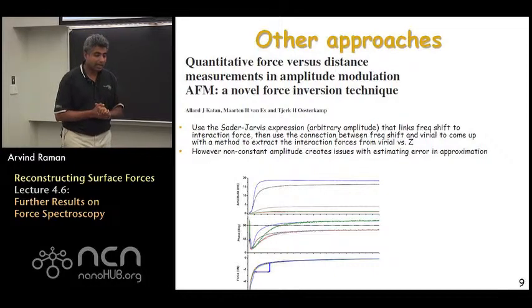So with that, I'd like to end this week 4 of the course, and starting in the next week, we'll transition to talking about interesting applications to measuring electrical forces, electrostatic forces, magnetic forces, and to do AFM, dynamic AFM in liquids. Thank you.